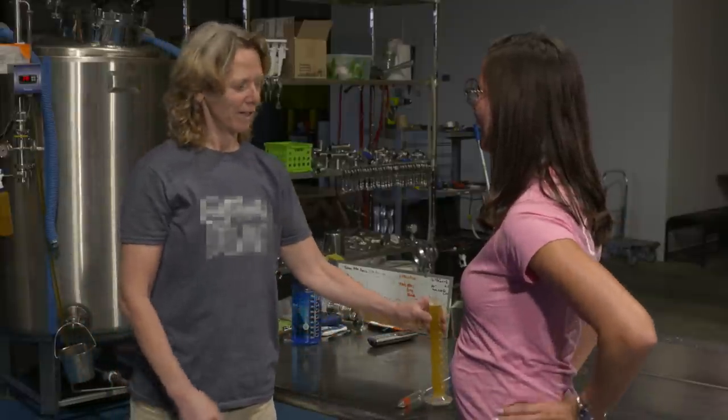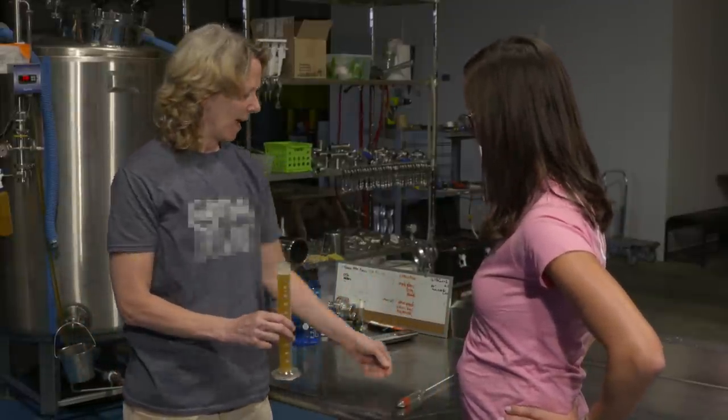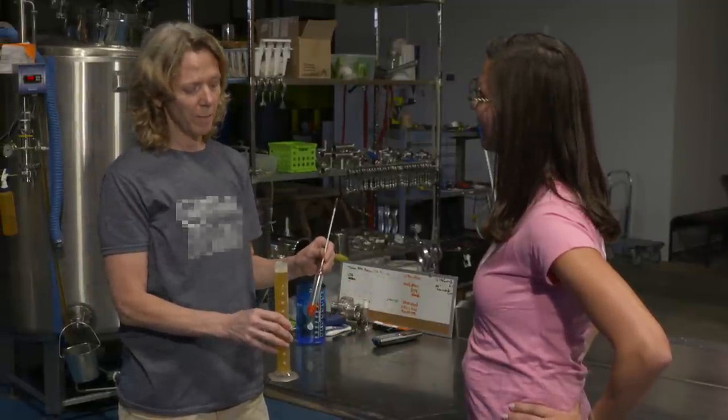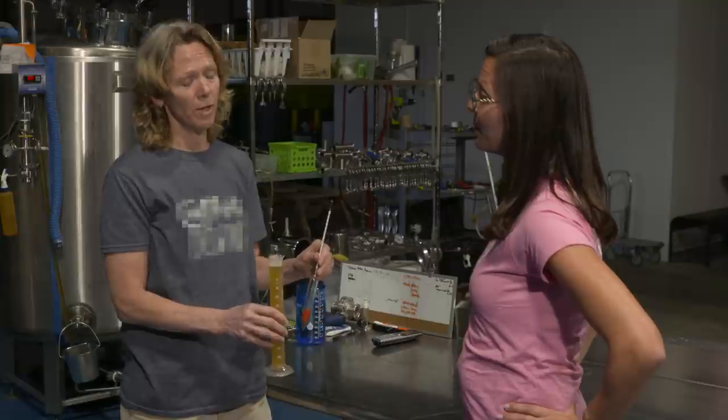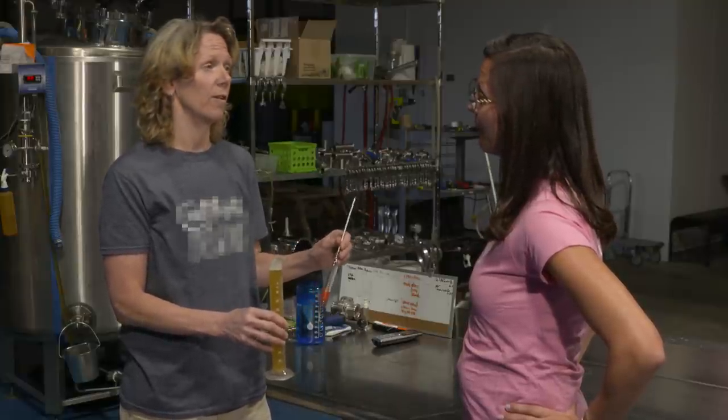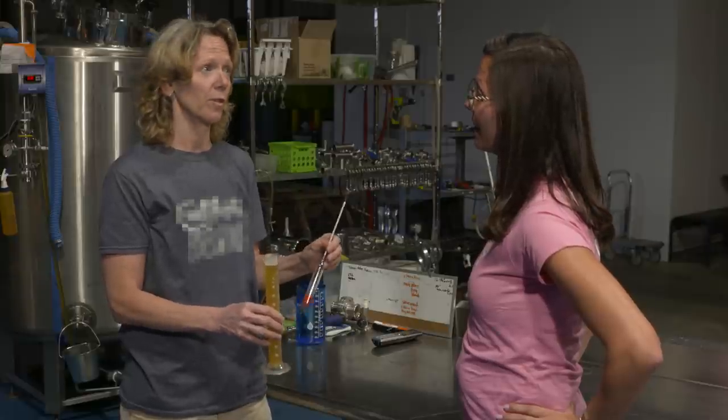I have a sample of beer that's just about finished fermenting, and I have a brewer's tool called a hydrometer. This helps us measure the alcohol content. It basically shows the progression of the wort from being very sugary to being filled with alcohol as the yeast converts the sugars to alcohol.